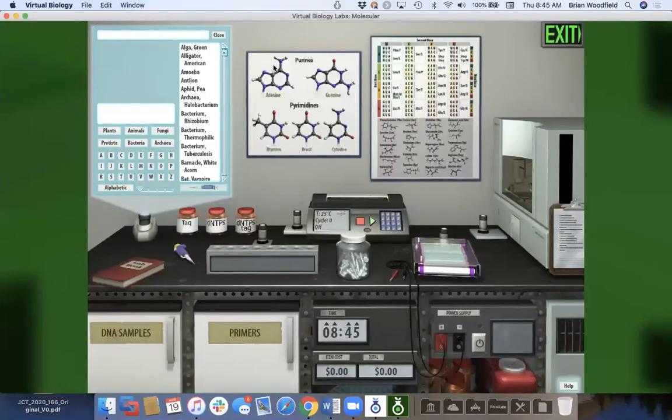So in the molecular lab, the idea here is to pick a species, pick a primer, amplify a certain gene using PCR, verify that with a gel, and then sequence it with the sequencer and look at the sequence and then analyze the sequence about what we know about how species are related at the DNA level. So for each of our species in our database, we went to GenBank and we divided the species into groups based on their characters, like plants or mammals, and then different kinds of insects. And we identified a set of genes, as little as 20 genes, up to maybe 60 genes for mammals. And we created a mini genome for these species based on real gene sequences of a particular set of genes. And then we added random DNA code in between these, and we created these little mini genomes.